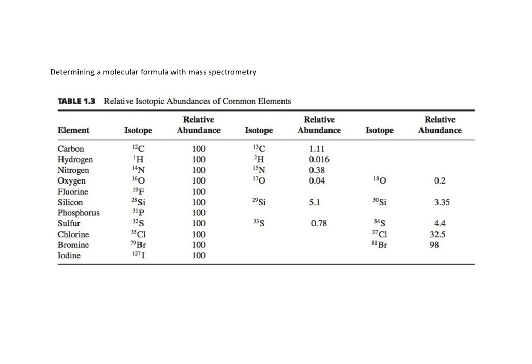The invention of mass spectrometry is linked with the discovery of isotopes about a century ago. In this class, we will use the presence of stable, naturally occurring isotopes and the ratios of their relative abundance to help characterize molecular formula. Particularly useful is the ratio of carbon-12 to carbon-13.